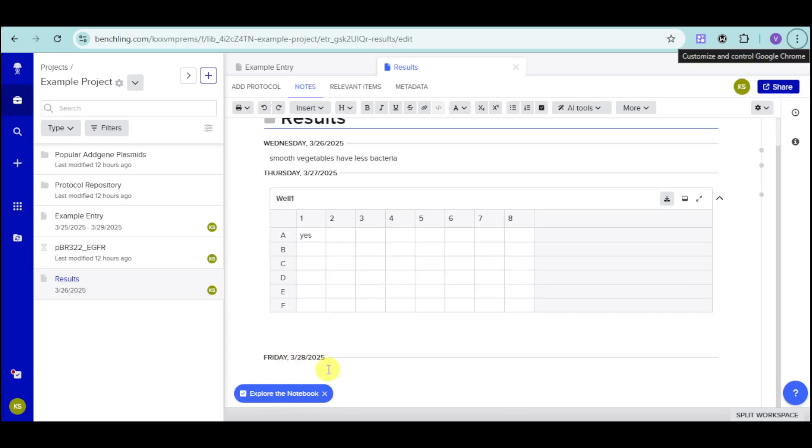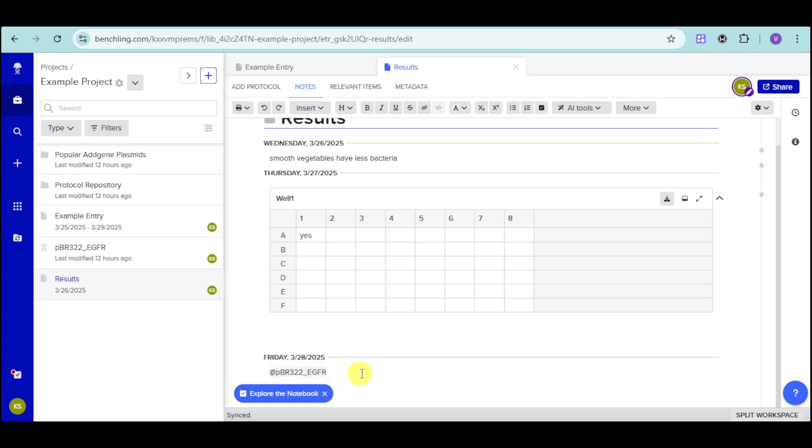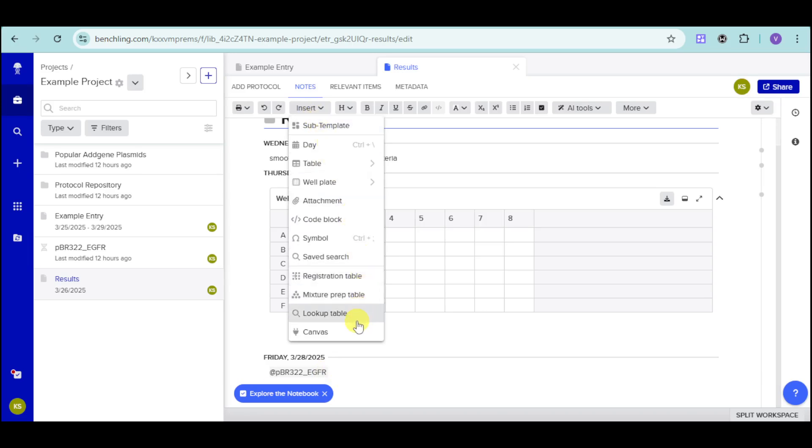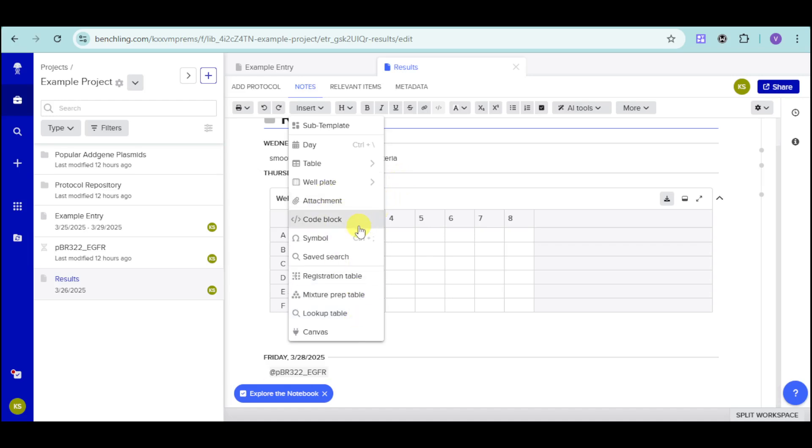Let me show you how to attach a particular sequence. You can just type in here the sequence right here. And as you can see, it will be synced. And it will be added onto that part. You can also click onto this insert option. And you can also input in here some registration table, canvas, lookup table, as well as a lot more. You can also add in here a code block or some symbols for this one.